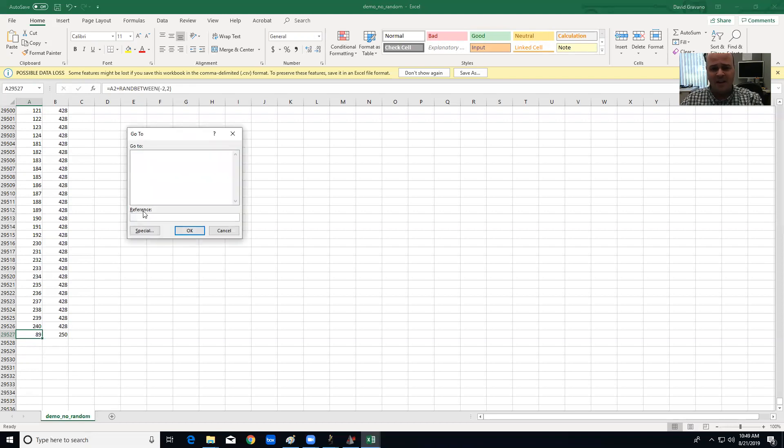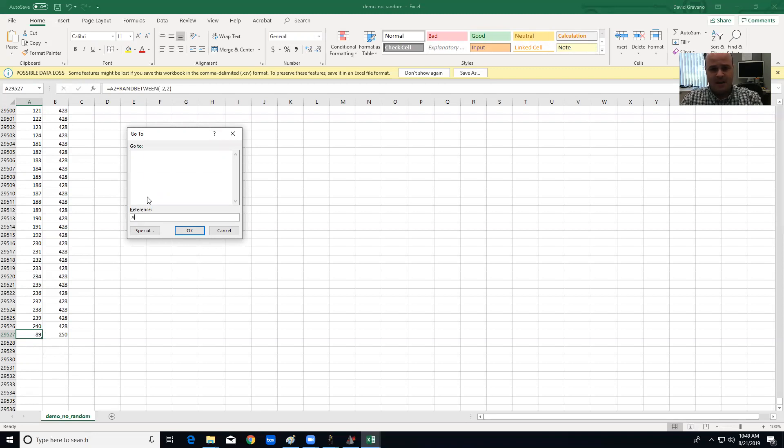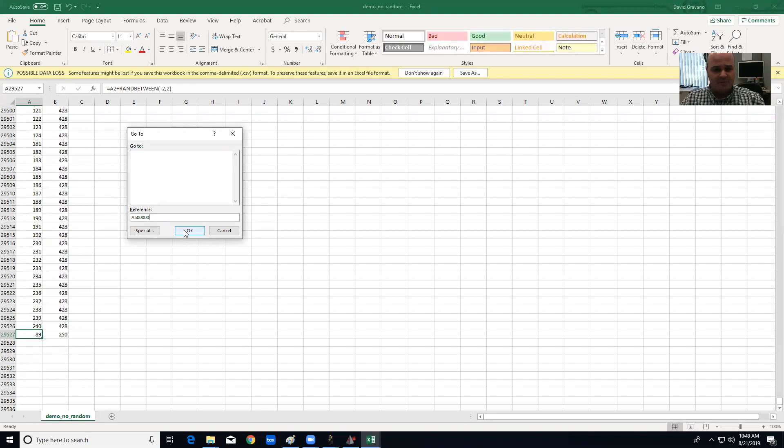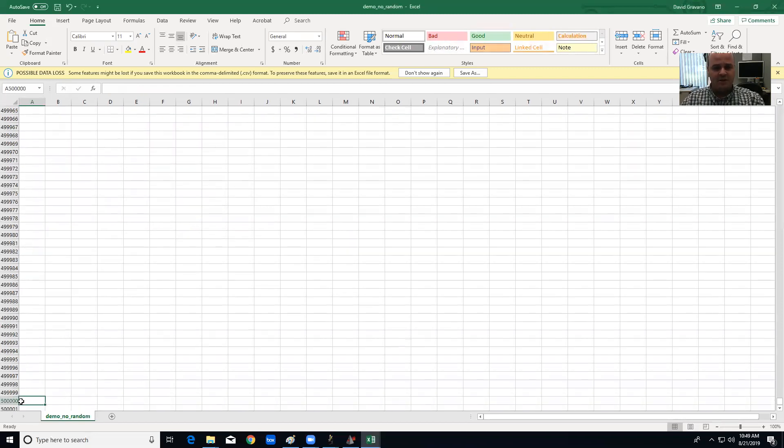So I'm going to press the F5 button and I'm going to put a 500,000. So what that's going to do is go down to the 500,000th row.